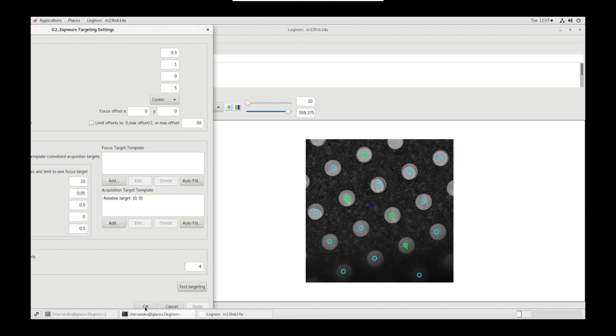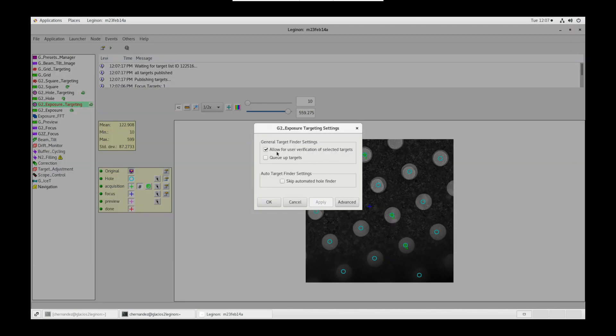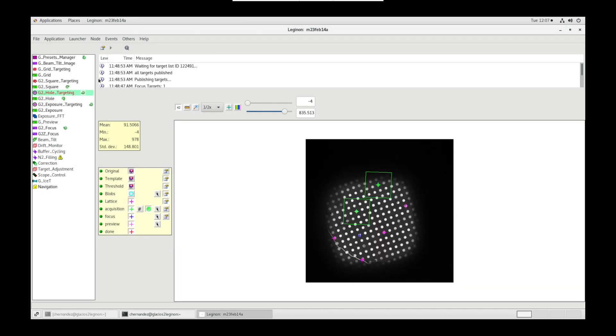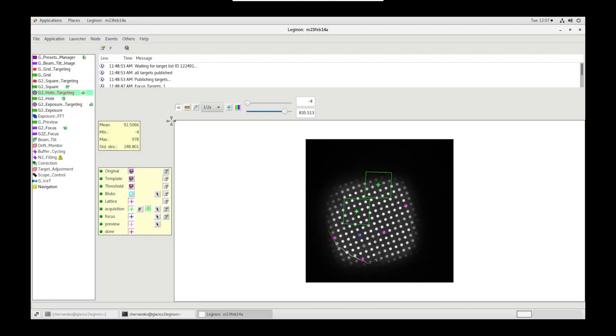Again, try to be loose with thresholding. Once satisfied, we can submit targets and turn off allow user verification of selected targets. Let's go back to whole targeting in settings. Also turn off allow user verification of selected targets. And let's let the session run.